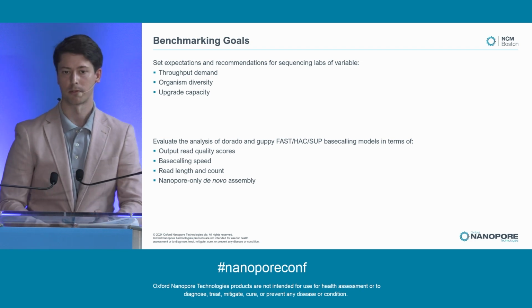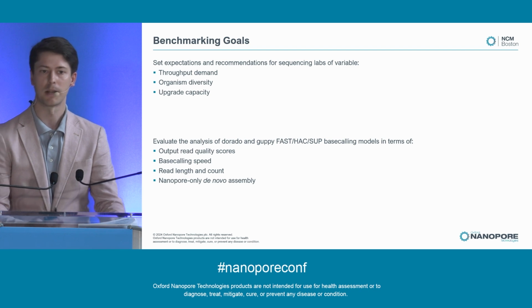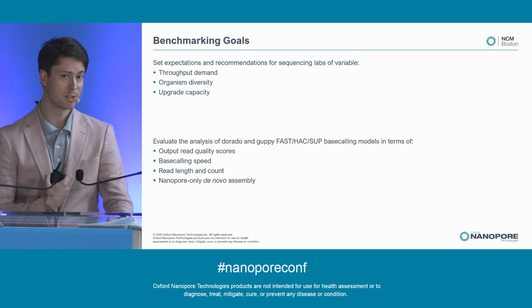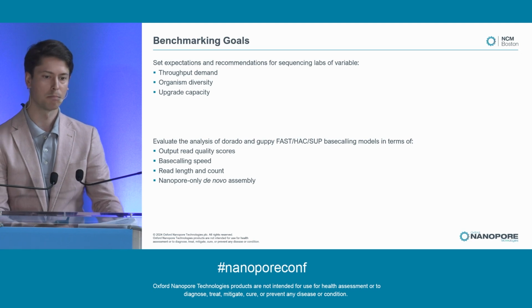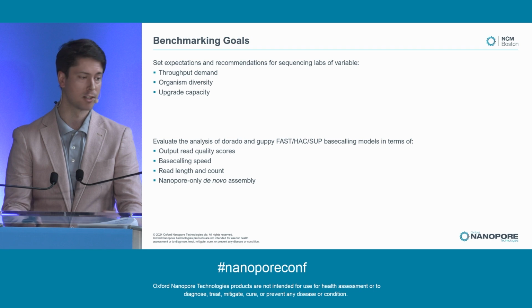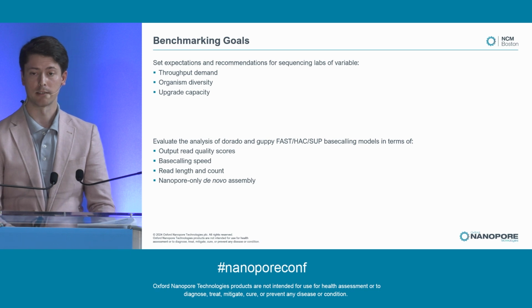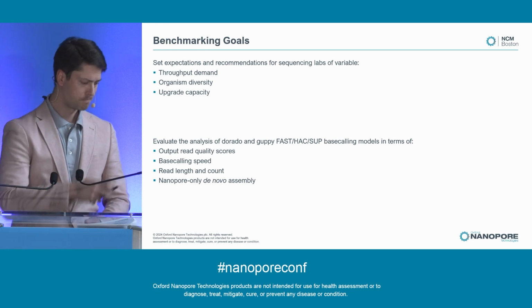And to touch on that a little bit further, the base calling software that we use, whether it's Guppy or Dorado, these are based on AI machine learning models. That means they had a training set, that means they had a test set, and at least I personally don't know what was in either of those. So the possibility that different genomic content, be that GC content, tandem repeat regions, secondary structures, any of those may have an impact on the Oxford Nanopore ability to base call, is something that I'm not personally keenly aware of. So we need to be concerned with the breadth of our collection.